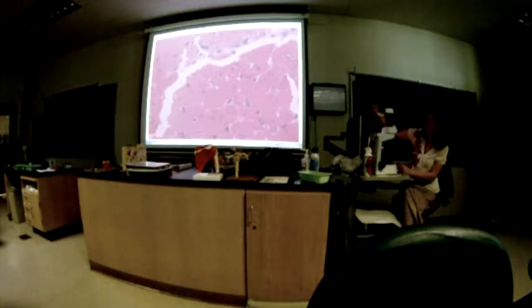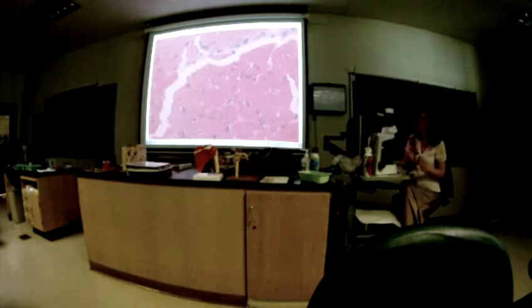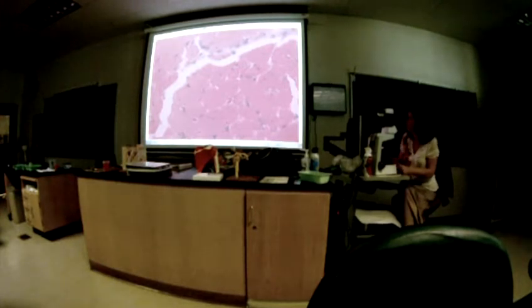Here's one that's a little bit more separated out, the skeletal muscle cell. Endomysium is the layer around it. This is the muscle cell. Nucleus. How many nuclei? Just one or more than one per cell? Multi, more than one, multinucleated? Yeah.